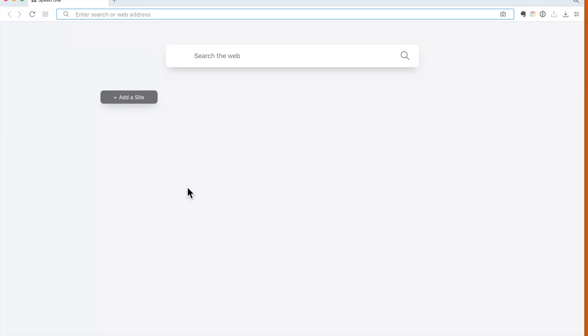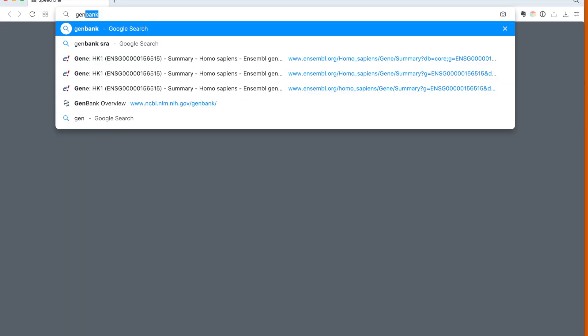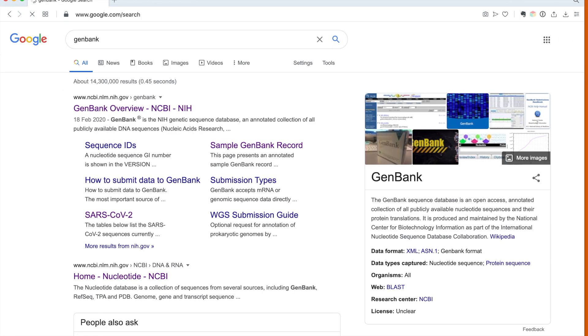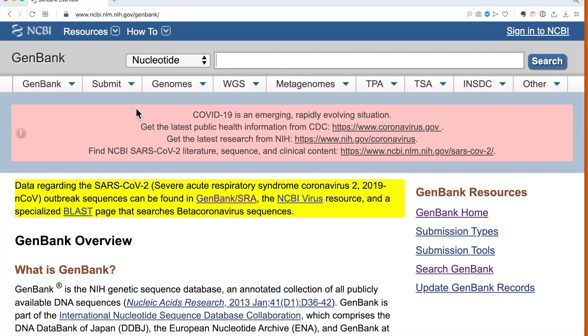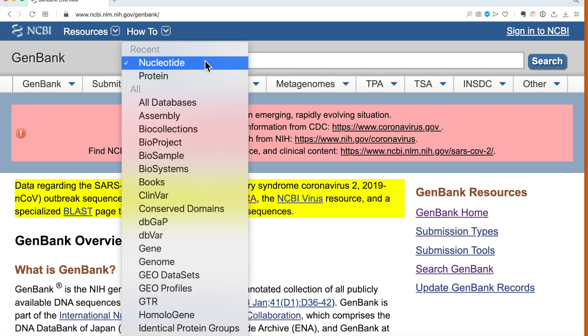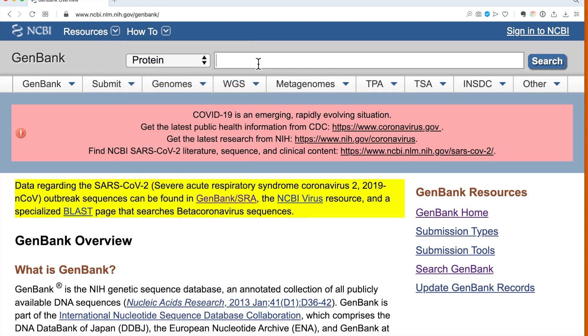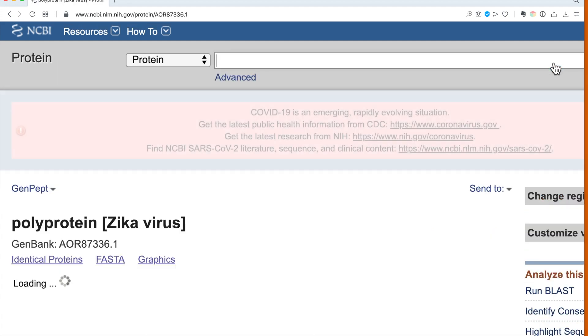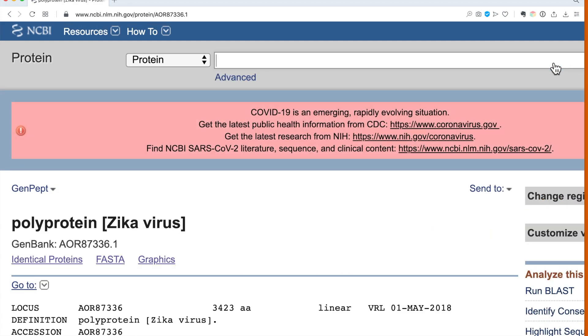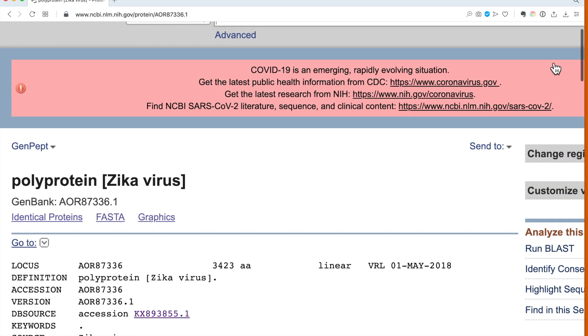Opening a new browser window, search for GenBank. Now in protein we enter that ID which I have copied from the instructions and I hit search to go to the right entry directly.